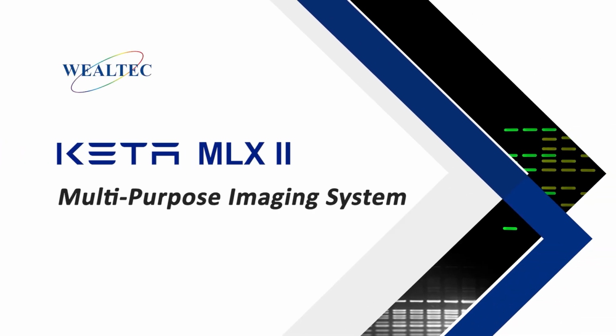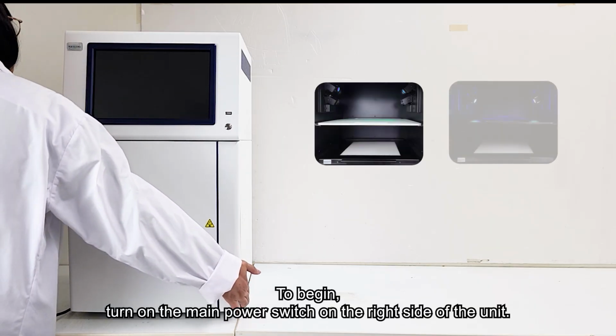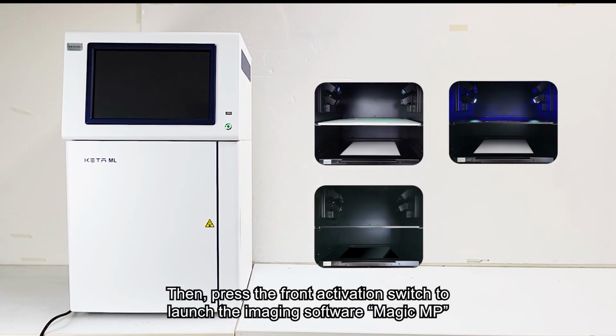KETA MLX2 Imaging System. Operating Features Overview. To begin, turn on the main power switch on the right side of the unit. Then, press the front activation switch to launch the imaging software, Magic MP.